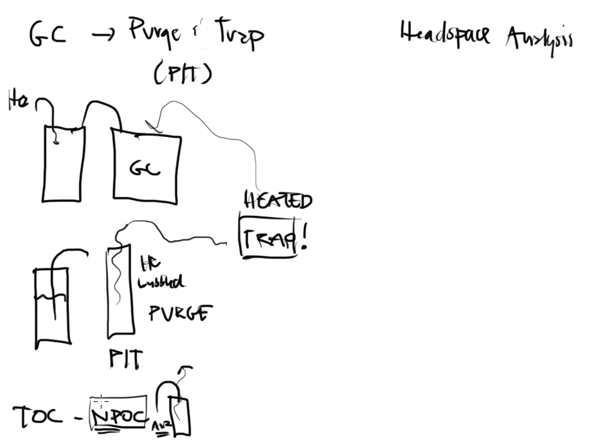Well, the purpose of this Purge and Trap instrument, it does something similar, but it's the other half of the story. One is the cup half full, one's the cup half empty. Meaning the TOC is going to measure the non-purgeable half of the sample, and the Purge and Trap will focus on the purgeable content of the sample.